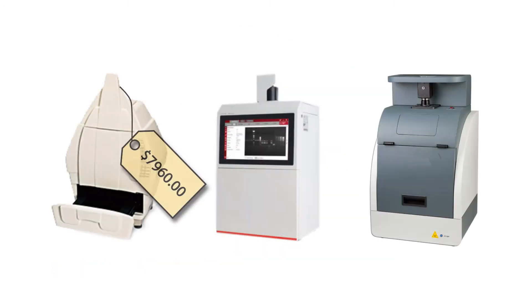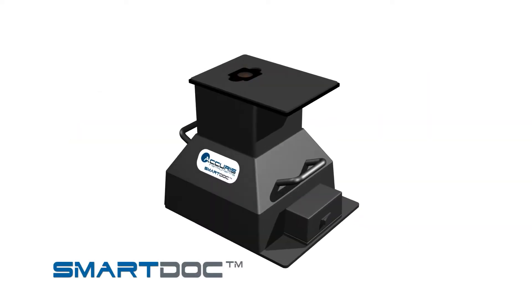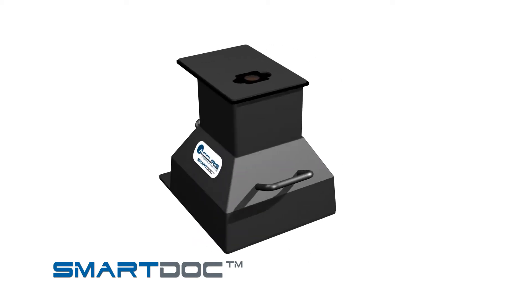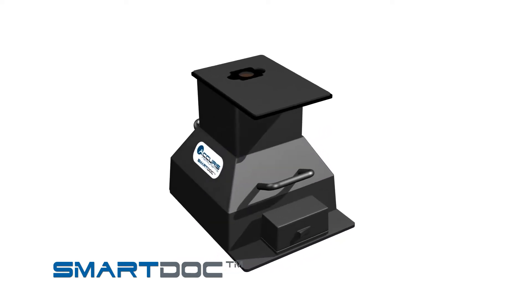Most gel imaging systems are expensive, costing thousands of dollars and include bells, whistles, and features you may not need. If you're looking for a convenient, compact, and economical system for viewing and documenting your DNA gels, look no further than the SmartDoc.